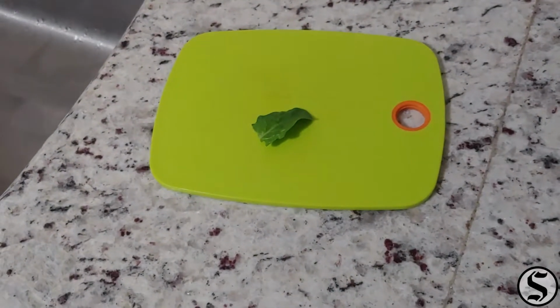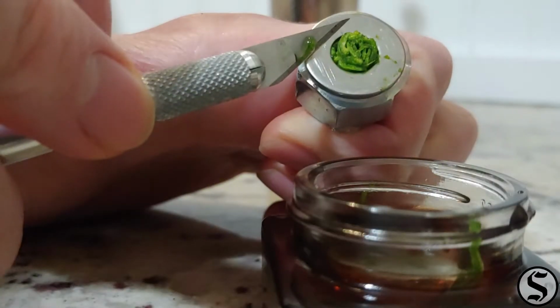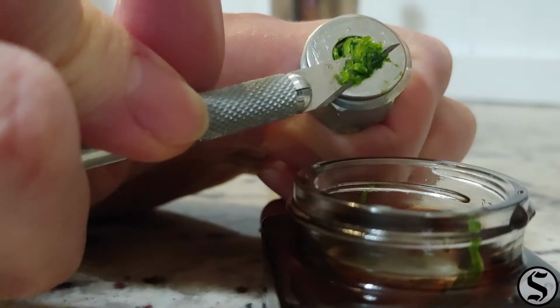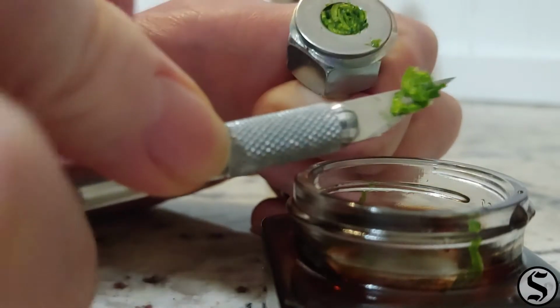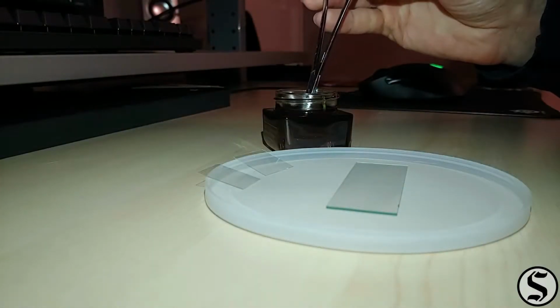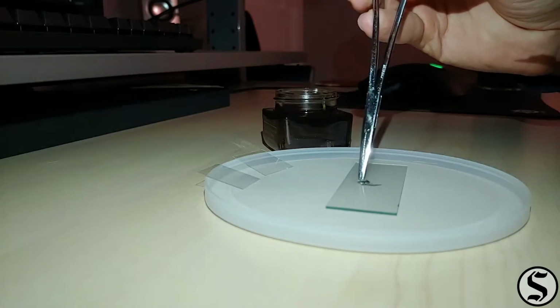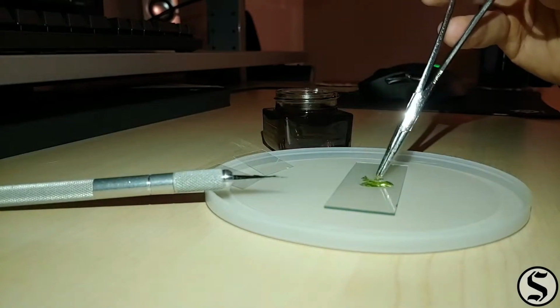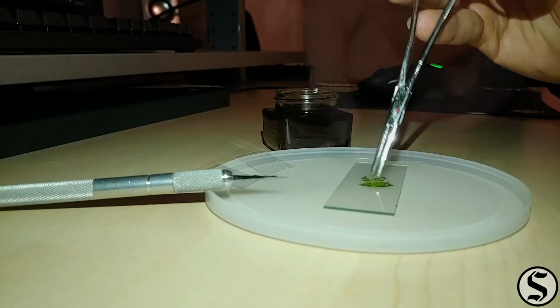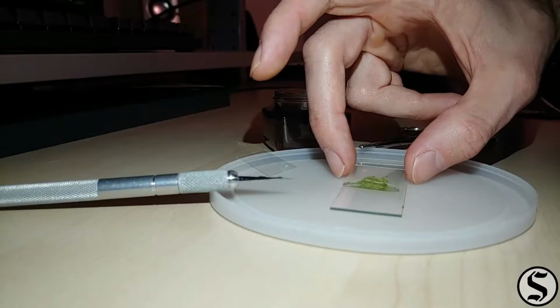Today's sample is a spinach leaf. Not a decomposing one this time, though. And I really wanted to look at the cross-section of the spinach leaf, so I folded one up into my microtome and got a bunch of little slices. I'm kind of going for the shotgun approach here. I don't have any way to control which direction these are facing, so I'm hoping that if I put enough on a slide, at least one of them will be facing sideways.